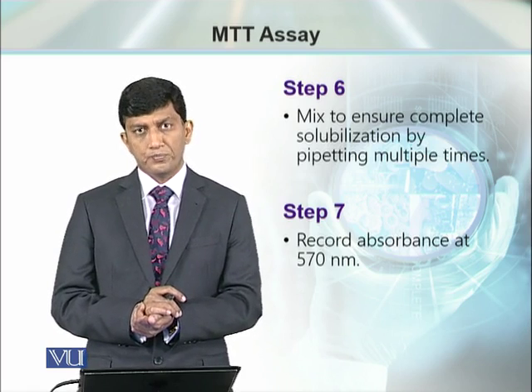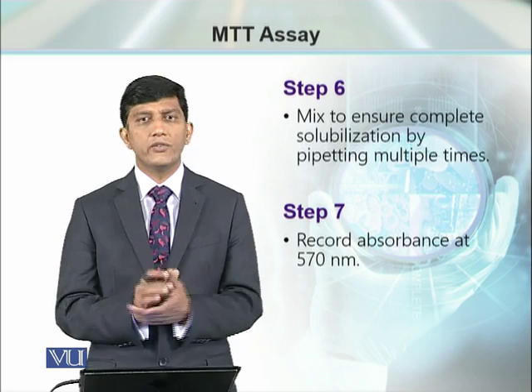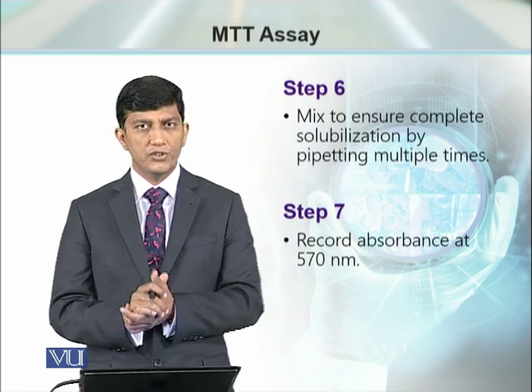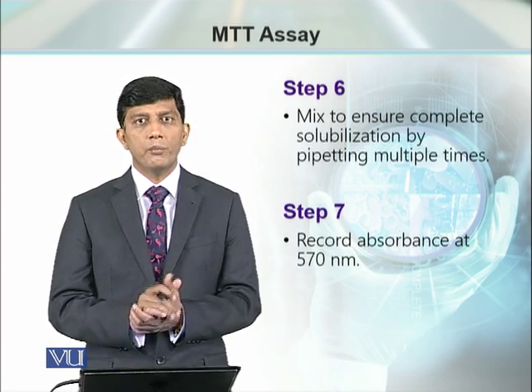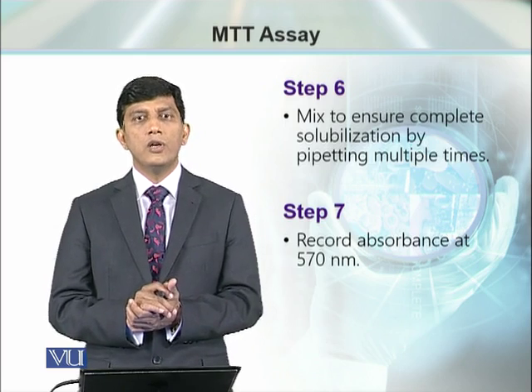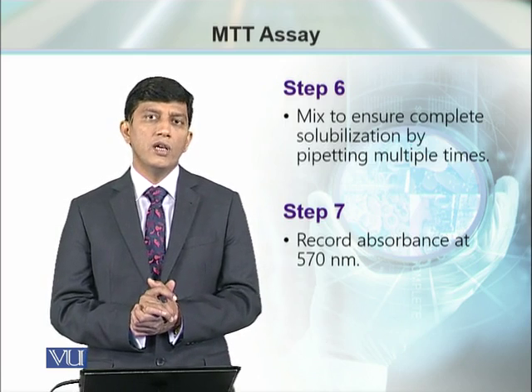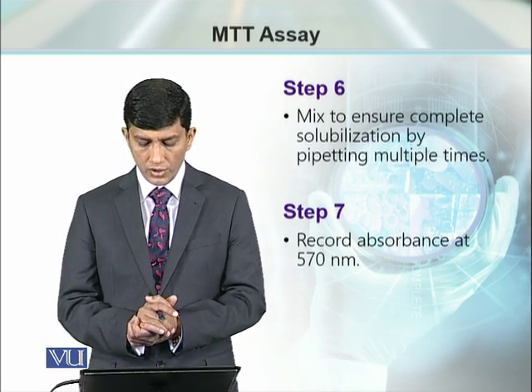For that purpose, we do not need extensive mixing using any vibrator or shaker. We can simply take this multi-channel pipette, and pipetting up and down will ensure thorough mixing of the formazan crystals into the given volume of the solution.